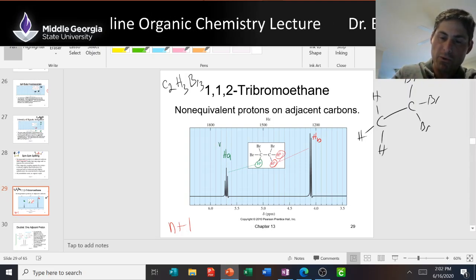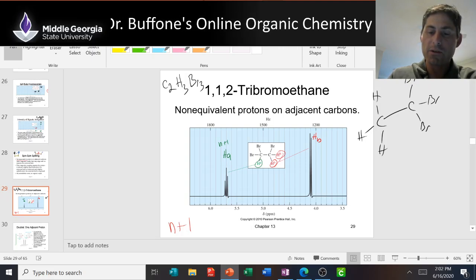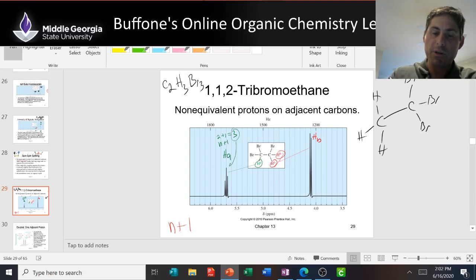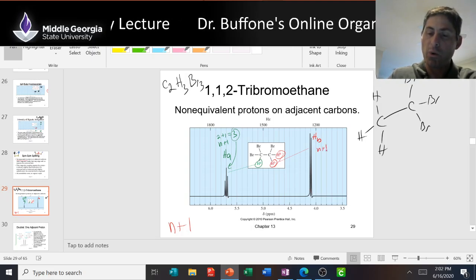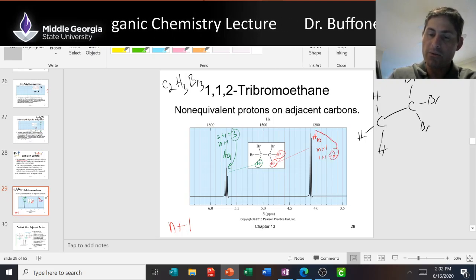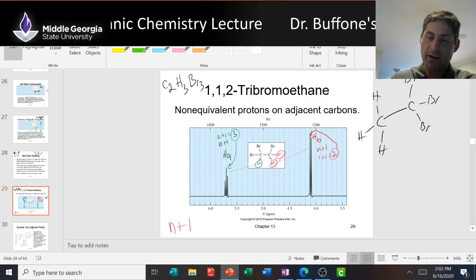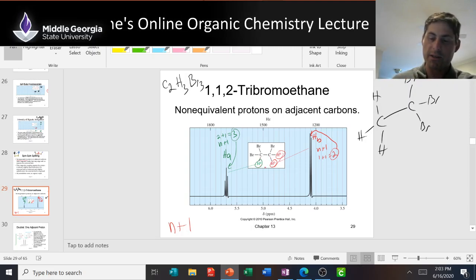We're going to look at the N+1 rule to see splitting. If HA, this guy, has 2 proton neighbors, then N is equal to 2. It's 2 plus 1 equals 3. Its signal gets split into a triplet. The HBs, which give you one signal, have only 1 proton neighbor. That's this guy. So 1 plus 1 is equal to 2. That signal for HB gets split into a doublet. So why, if you have 1 proton neighbor, does your signal get split into a doublet? And why, if you have 2 proton neighbors, 1, 2, 3 bonds away, does it get split into a triplet? Well, here's the explanation.